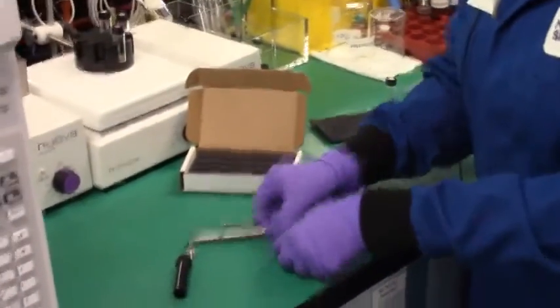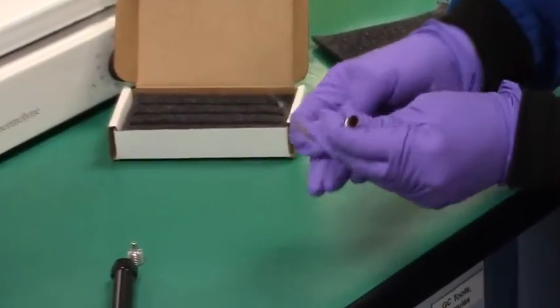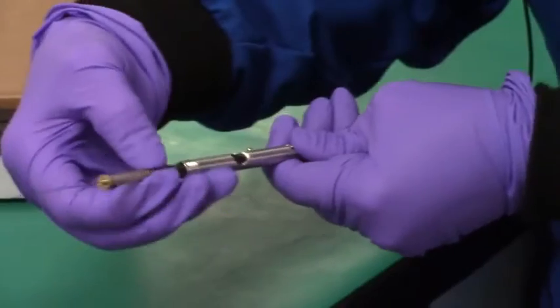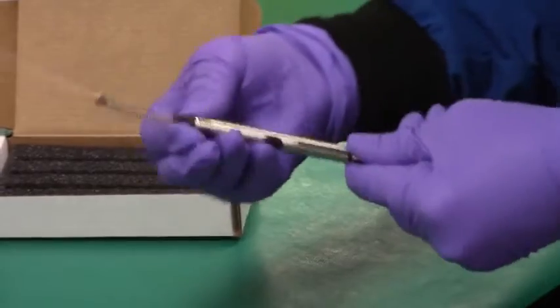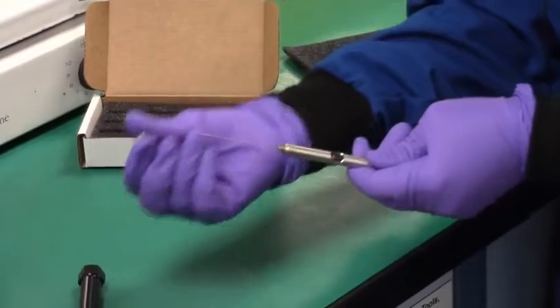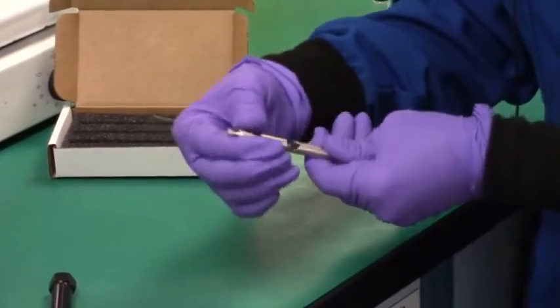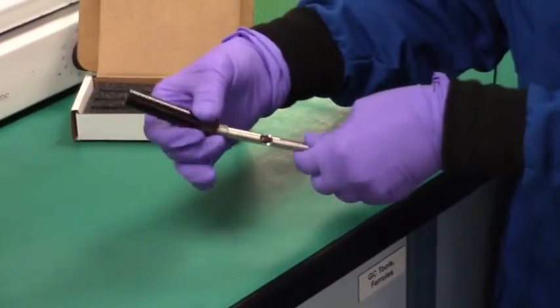So the first step is to thread it onto the plunger. So the plunger's got a female threaded fitting, and I've got a male threaded fitting on the end of the fiber. So I depress the plunger to bring that female fitting out, thread my fiber on the end, pull the plunger back up. I'm going to put this nut on the bottom next. Just hand tight is fine. And then this plastic depth gauge.